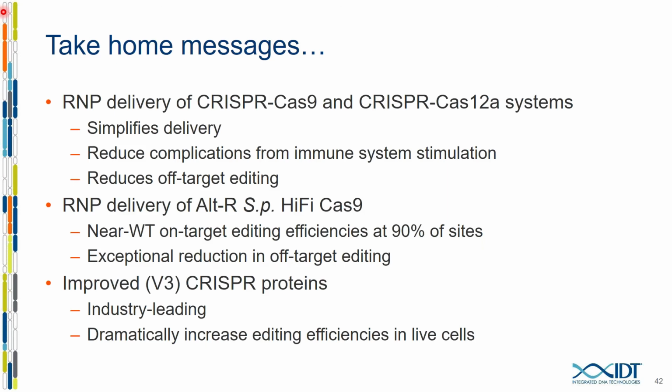All right. We're going to do one more question from Dale, who would like to know what the shelf life of the HiFi Cas9 protein is. Oh, great question. We've tested this and we haven't seen any difference between our HiFi and our wild type. We've tested this in so many different ways, looking at 4 degrees stored in liquid, minus 20 in liquid phase. We've kept it at minus 80, and it still shows 100% function out to a year. I don't recall off the top of my head what the official recommendation is, but we don't find that HiFi is any less stable than wild type. Great question.